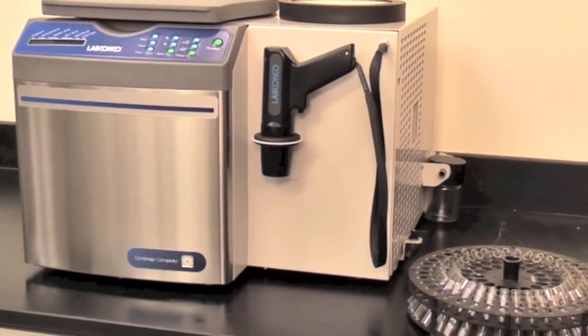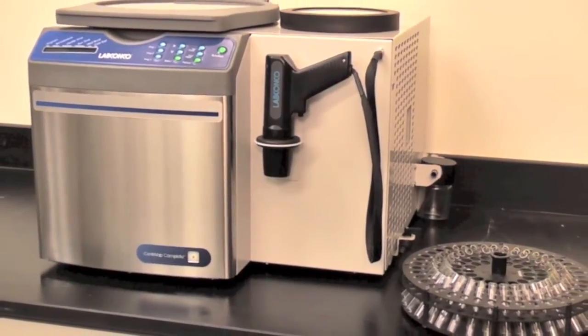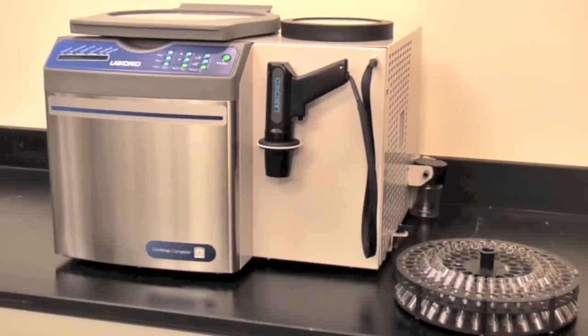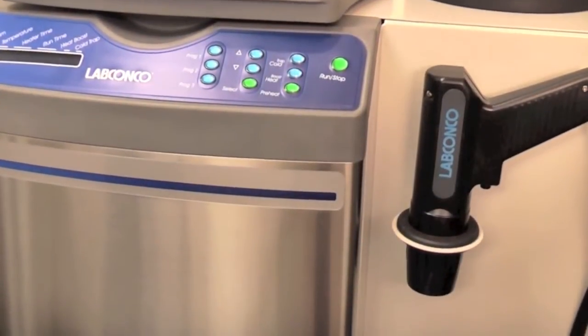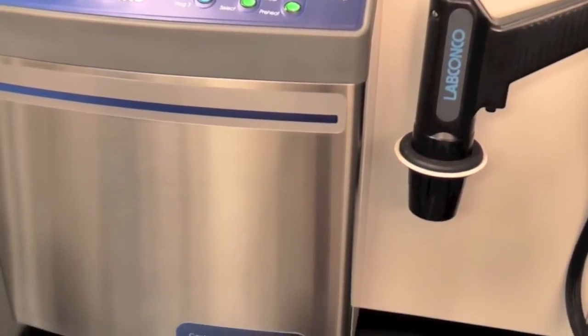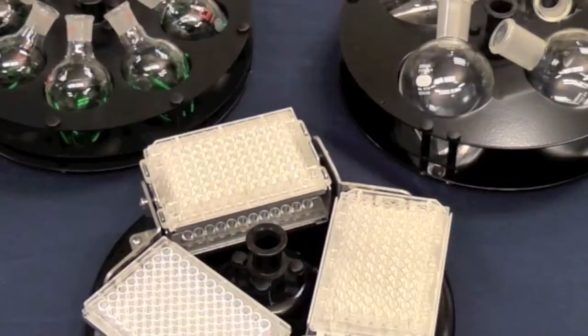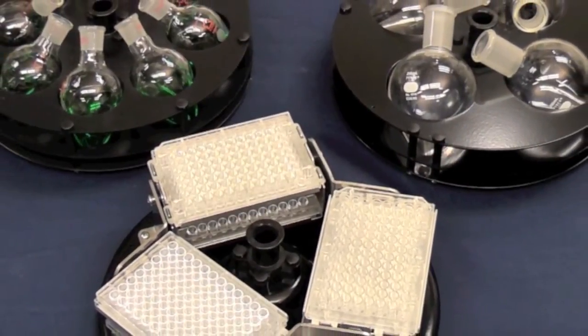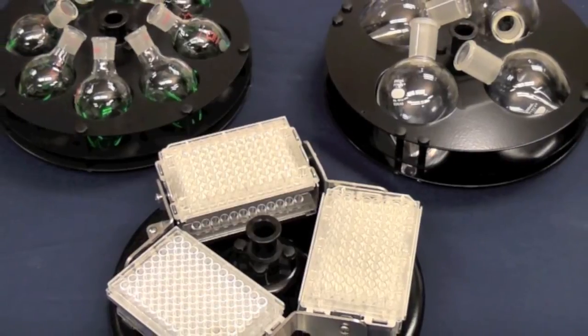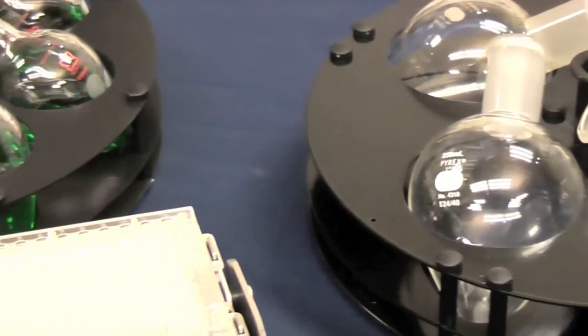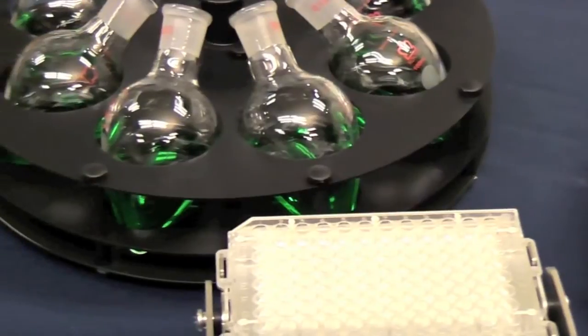The CentraVap Complete makes this step easy by integrating everything in one compact box for fast evaporation. A large chamber holds up to six micro-titer plates and 100 and 250 milliliter pear-shaped flasks. Other rotors are available.